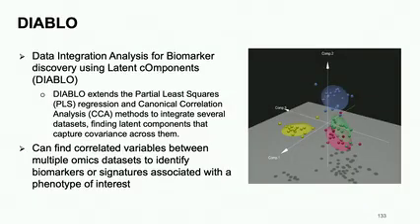That seems to make more sense. It seems more powerful. So this is a view, and I think this one is in MicrobiomeAnalyst, so you're probably going to the demo. You can just control how much covariance you want to explain, or how much difference between two groups you want to explain. So they allow you to identify these core multi-omics features that explain covariance and also explain the difference between different groups.